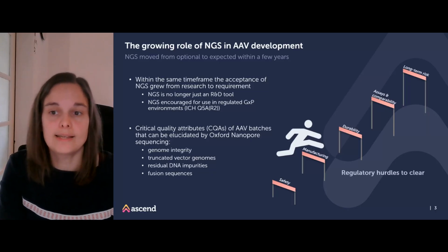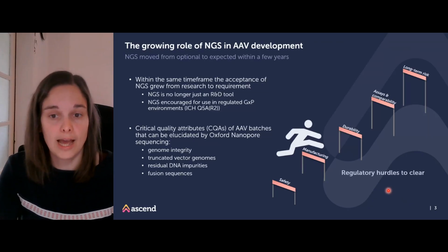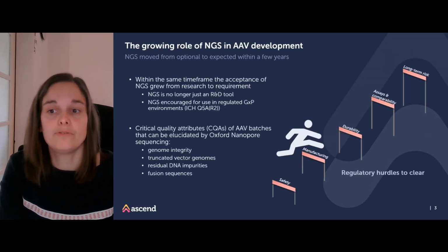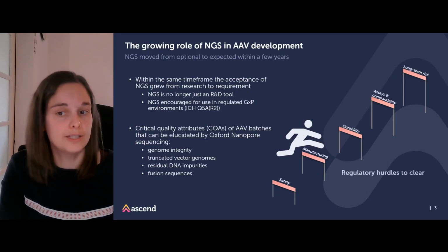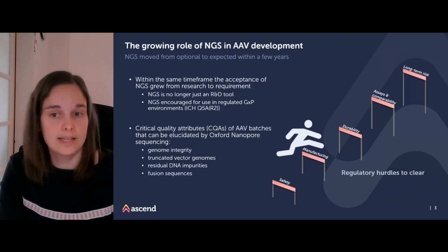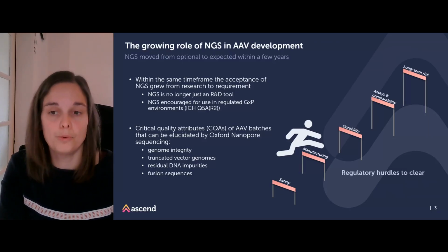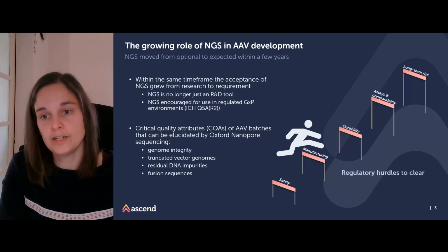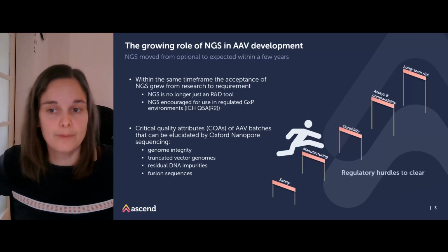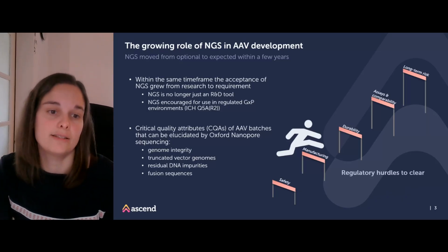Meanwhile, the gene therapy landscape has changed quite a lot. Regulatory requirements have become more stringent and more hurdles had to be cleared. And with that, the acceptance of NGS as a valuable tool for analytical AAV characterization has grown. Back in 2017, NGS methods were still relatively unknown in the AAV gene therapy field, and furthermore also pretty expensive. In recent years, however, costs have decreased and the ability to process large data sets in shorter time frames has improved considerably. As a result, the perception of NGS has shifted.